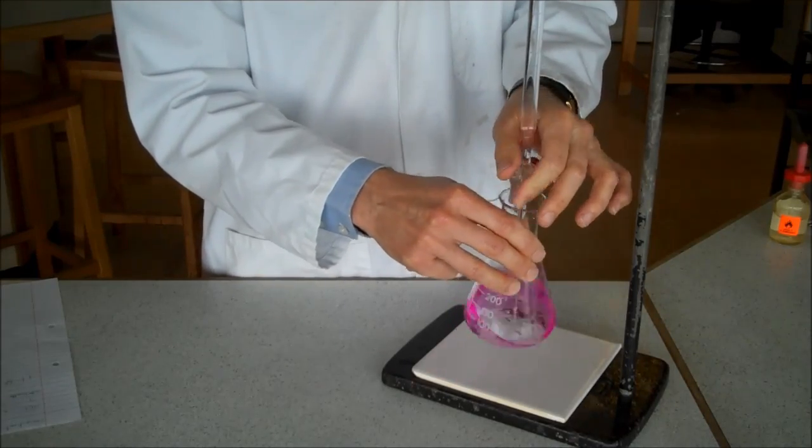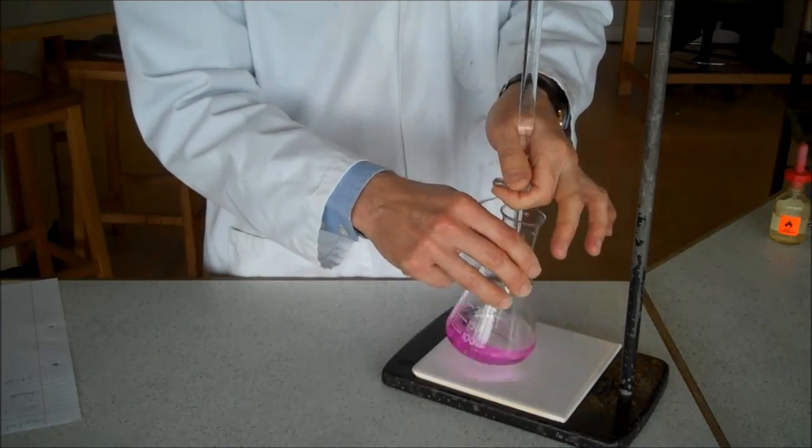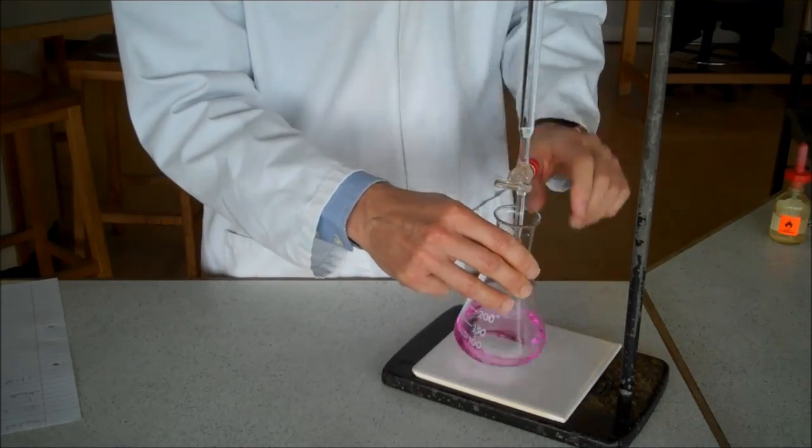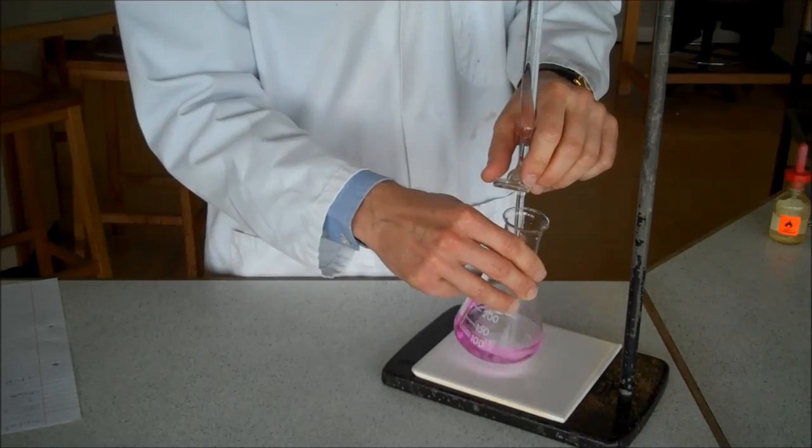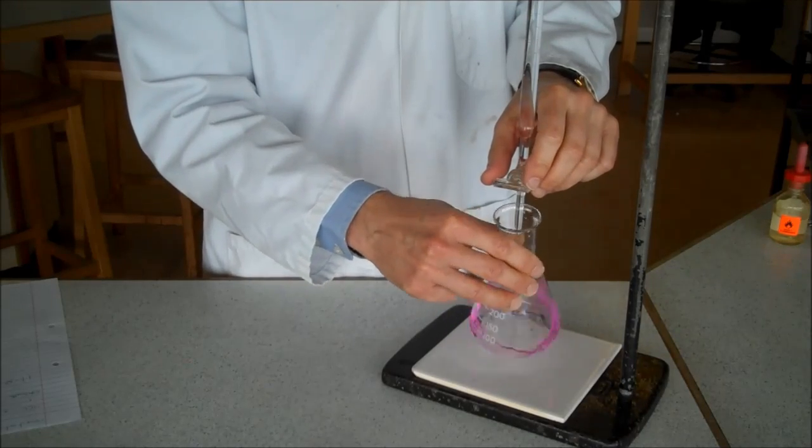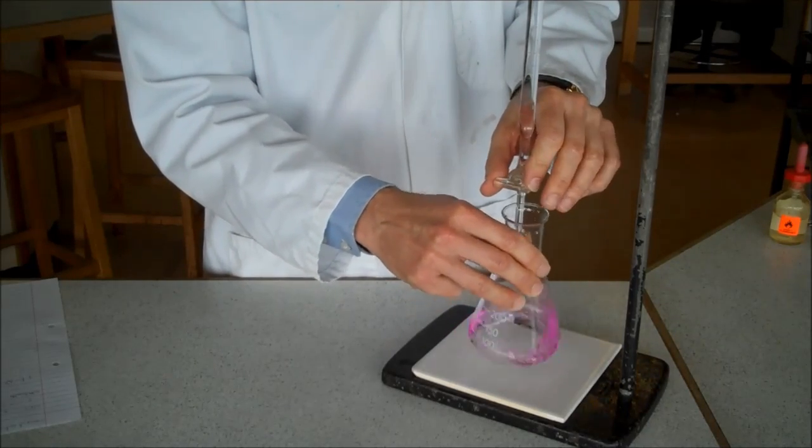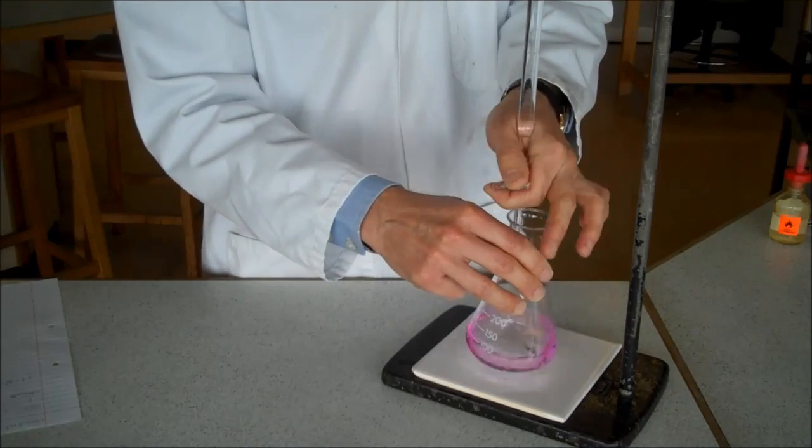By the way, in case I didn't mention it, the white tile is there so I can see even the faintest colour pink. You might see it's gone fairly faint pink now. One or two drops of acid is all it's going to take.